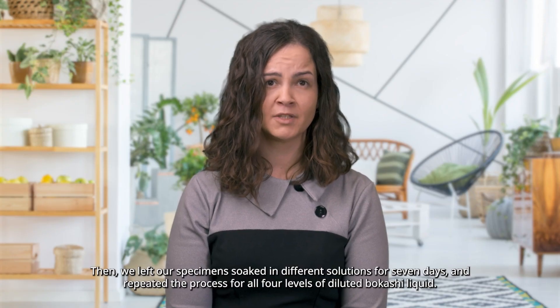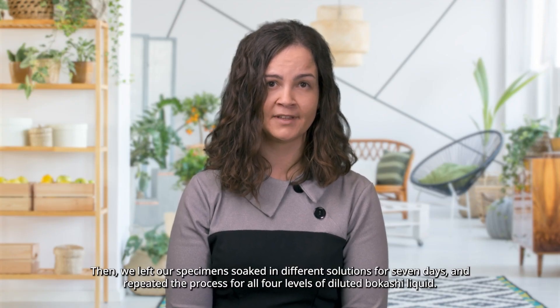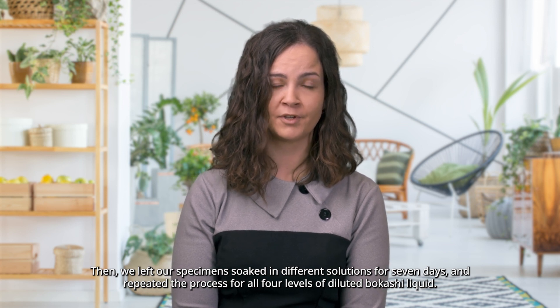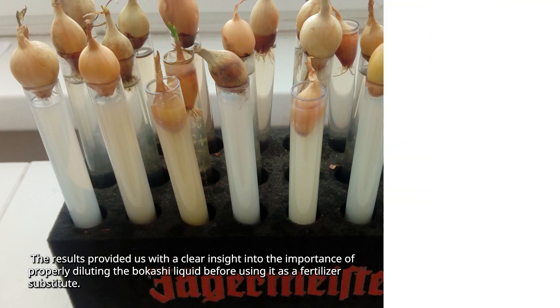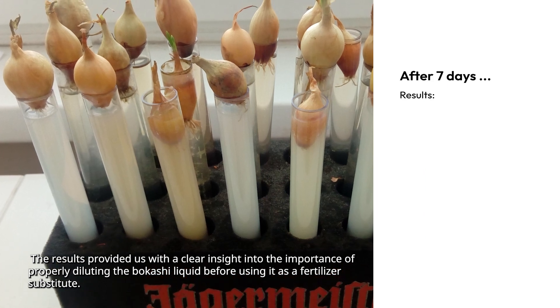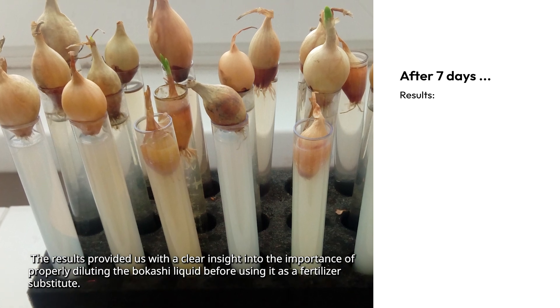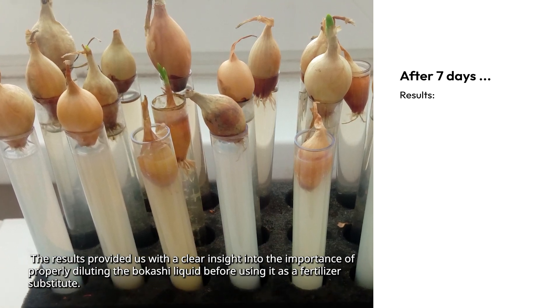Then we left our specimens to soak in different solutions for seven days and repeated the process for all four levels of diluted Bokashi liquid. The results provided us with a clear insight into the importance of properly diluting the Bokashi liquid before using it as a fertilizer substitute.